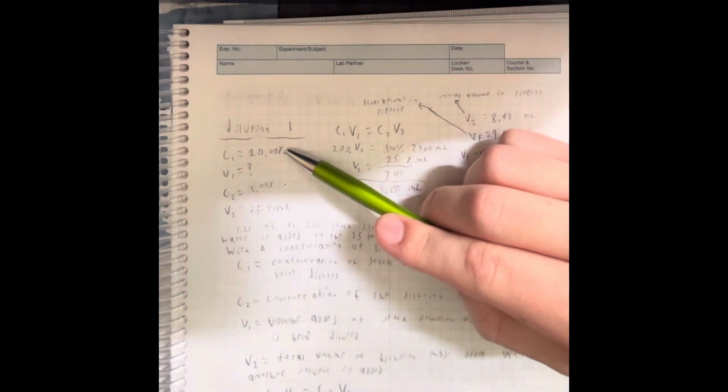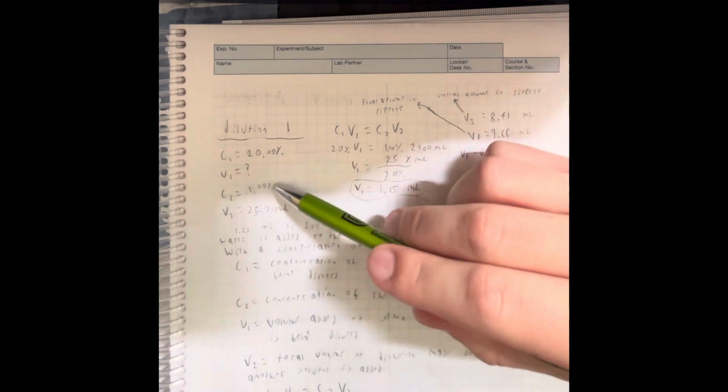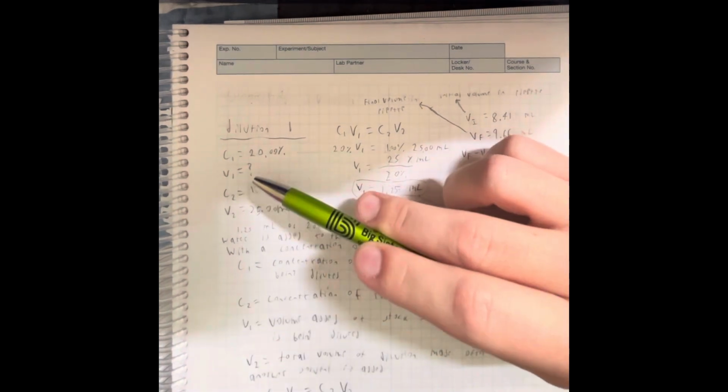C1 is the concentration of the stock solution, 20%. C2 is the concentration of the dilution that we are aiming for, 1%. V1 is the amount of stock solution we need to add to the 25 milliliter volumetric flask. We don't know that yet.